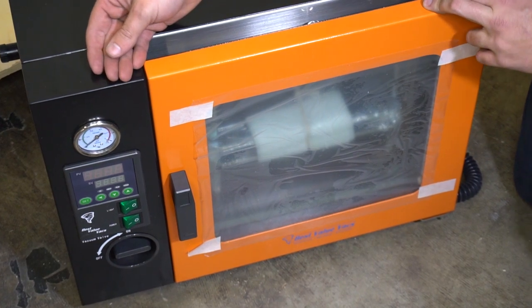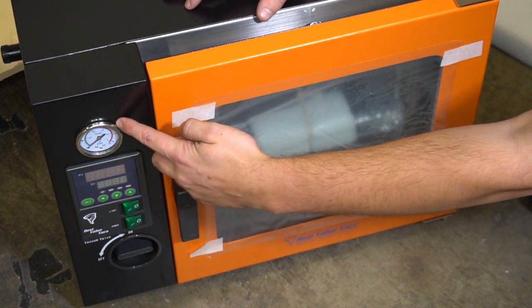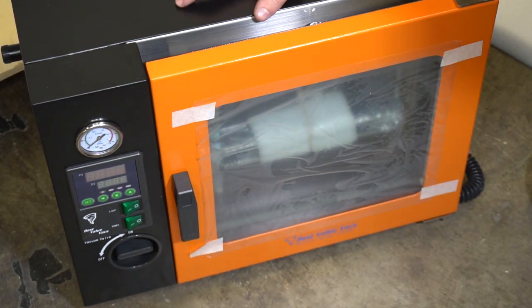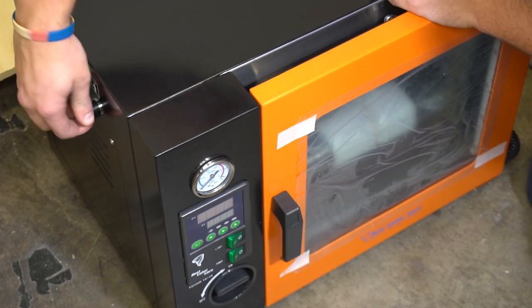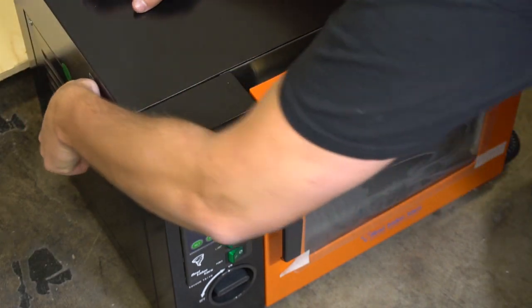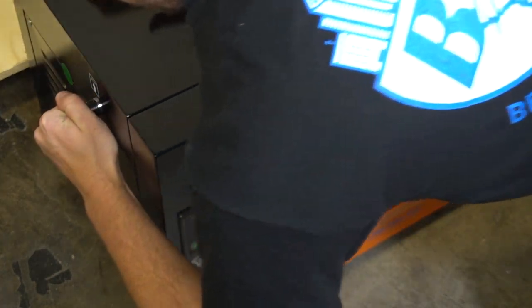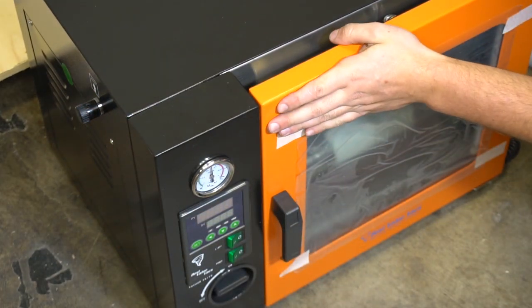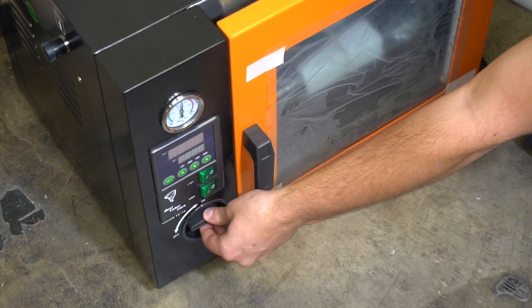The first thing you'll notice is every oven we send out is going to be shipped under a vacuum — you can see that on this gauge right here. To release that vacuum, you can do one of two things: you can open up your back release port on the side, or you can use your vacuum pump valve and release vacuum from the rear of the oven.